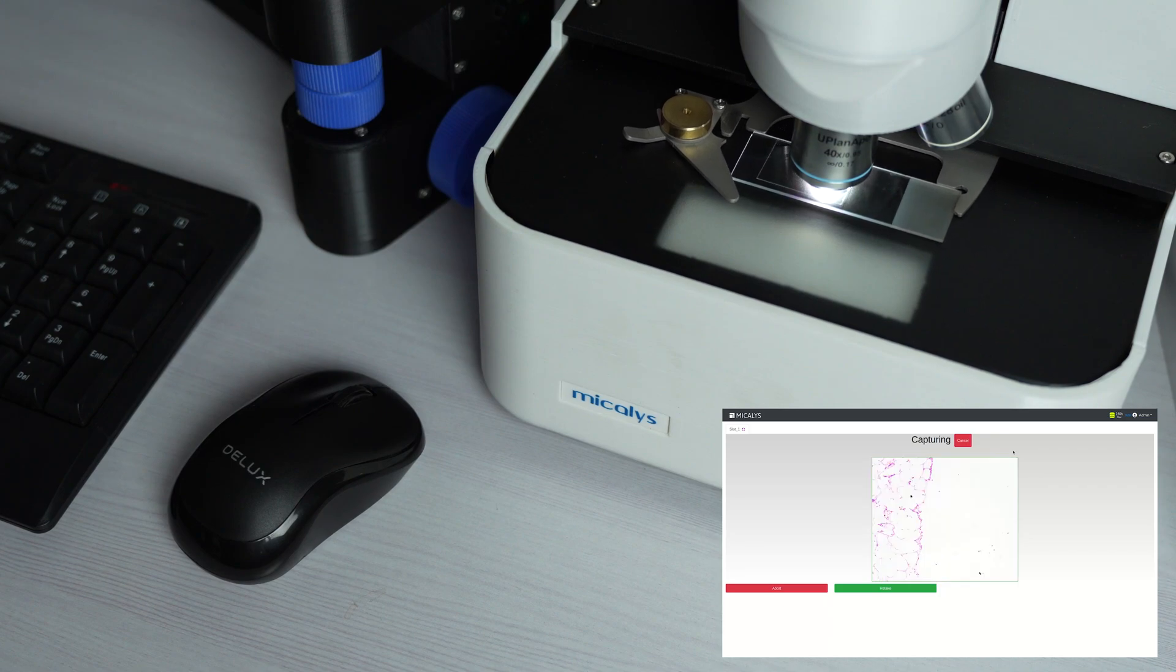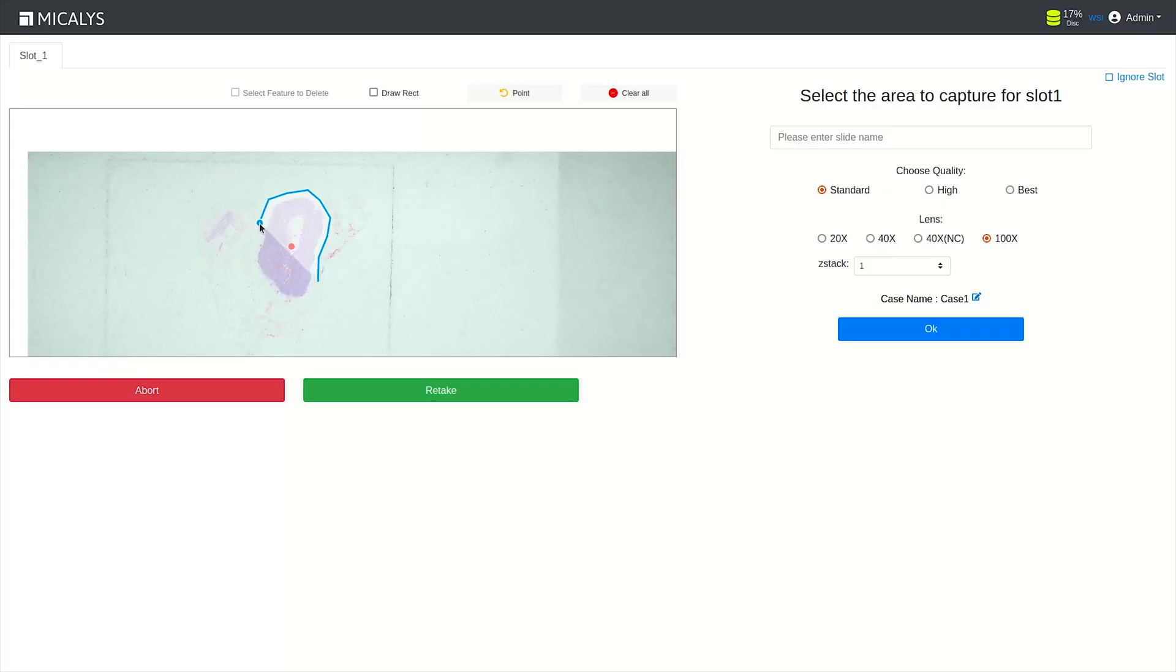Alternatively, if you prefer to choose a specific area for scanning, manual selection is also an option.